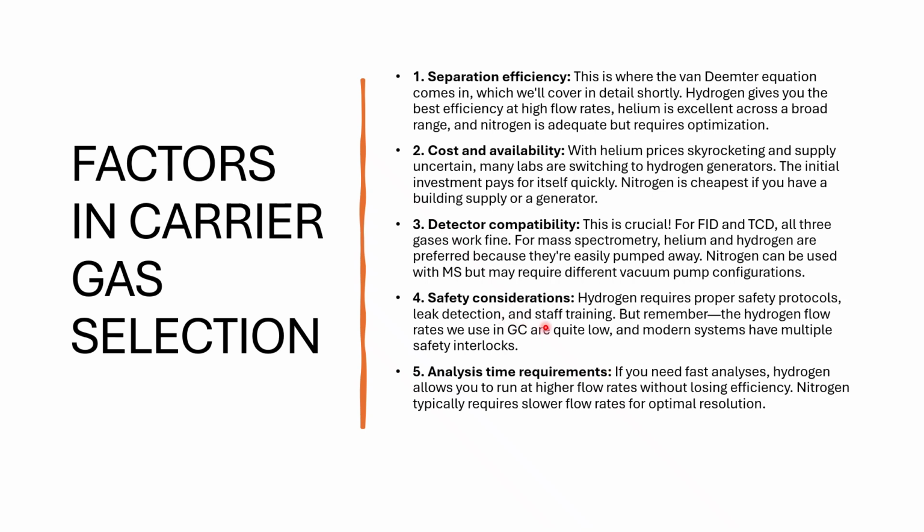Fourth, let's talk about safety considerations. Hydrogen requires proper safety protocols, leak detection and staff training. But remember, the hydrogen flow rates we use in GC are quite low and modern systems have multiple safety interlocks.